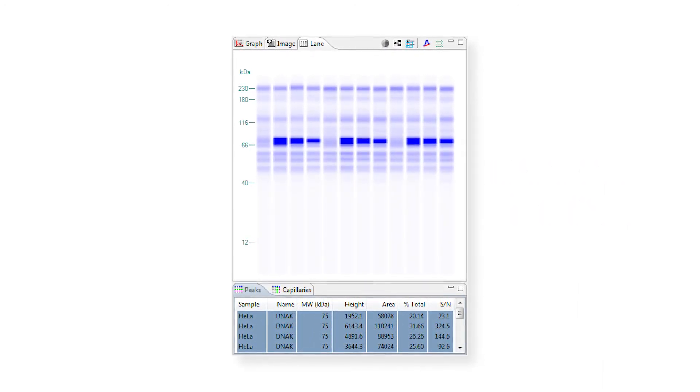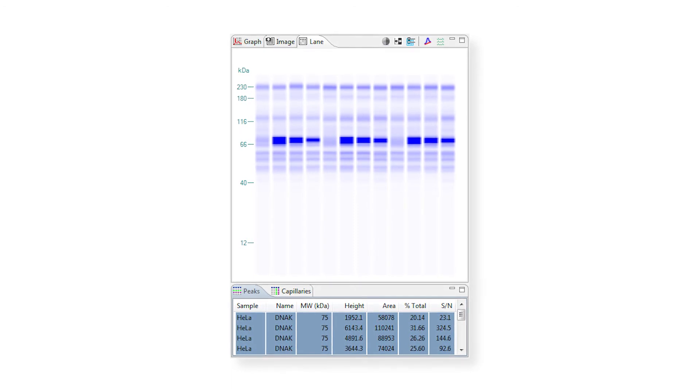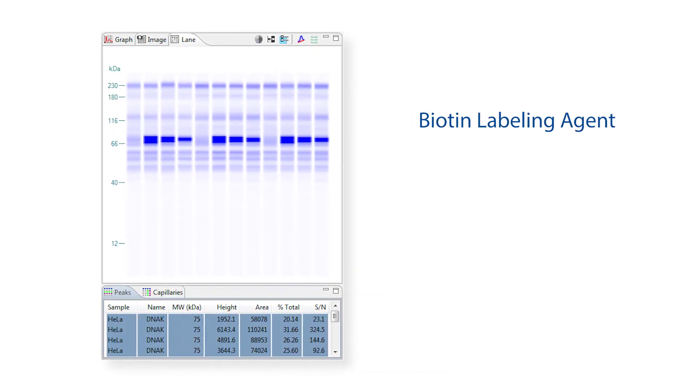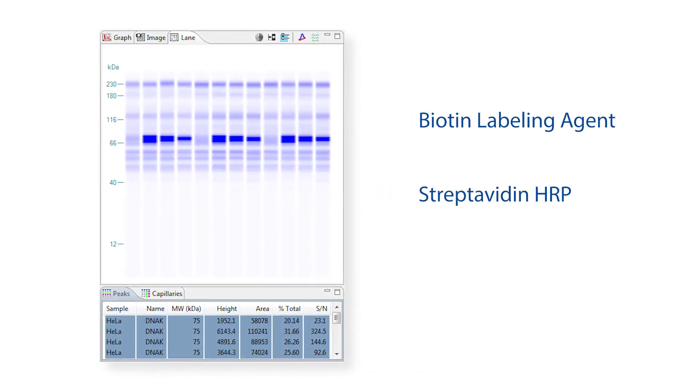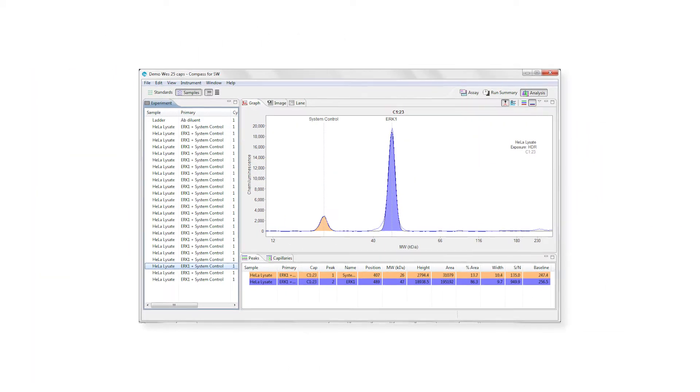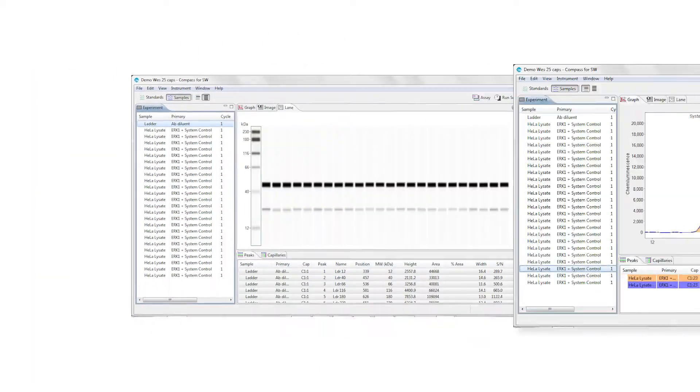Interested in looking at all the proteins in your lysate? Just leave out the antibodies and use a biotin labeling agent and streptavidin HRP to quantify total protein. Results are reported by Electropherogram and BlotView.